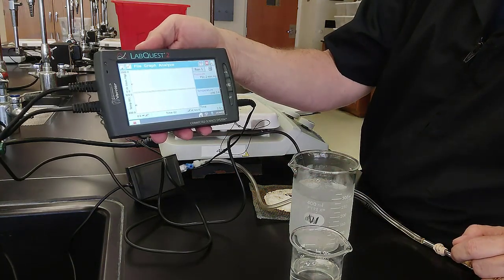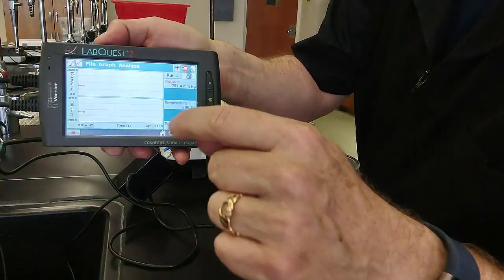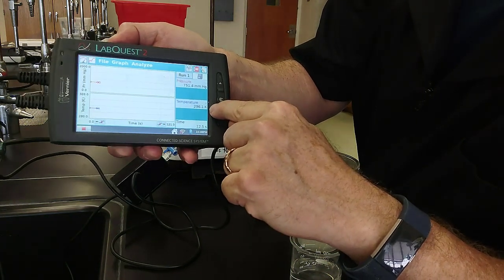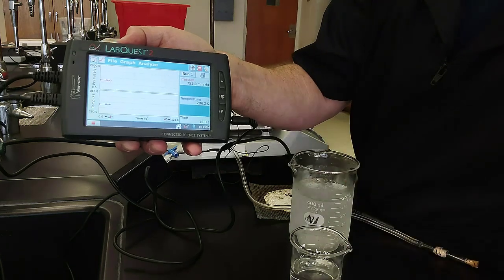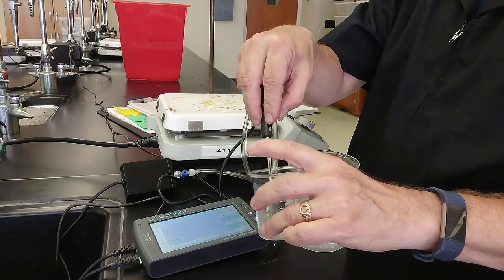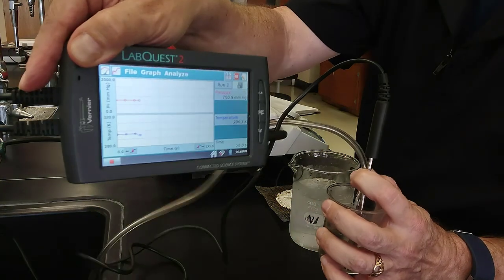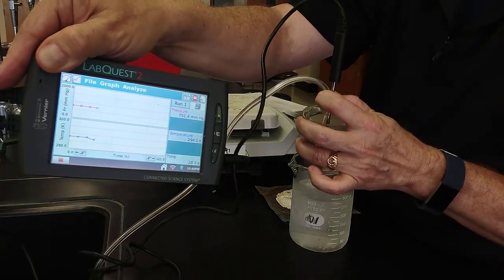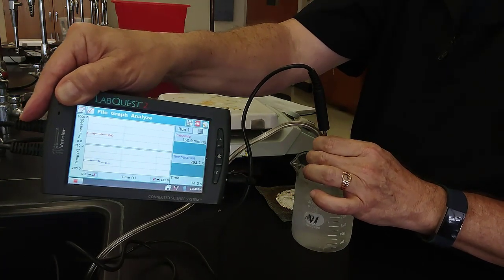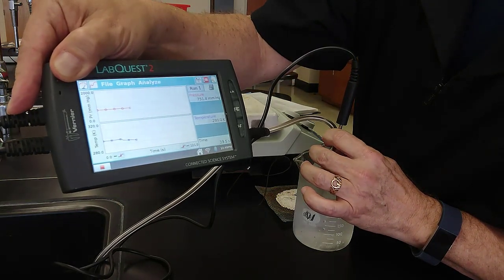All right, so I'm reading temperature and pressure. And if you can see right now, the pressure is 751, really close to atmospheric pressure. And my temperature is 296 Kelvin, right? I will submerge in my room temperature water, and we're getting no changes so far to our graph, but I'm going to now put my beaker into my ice bath. And you can see that the temperature is dropping.